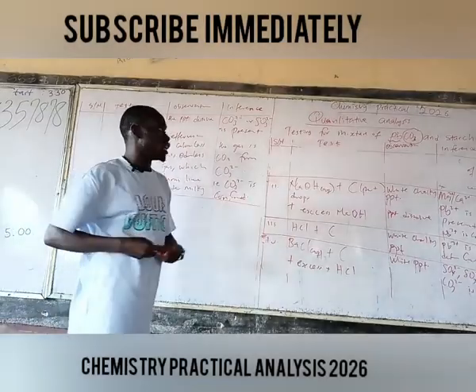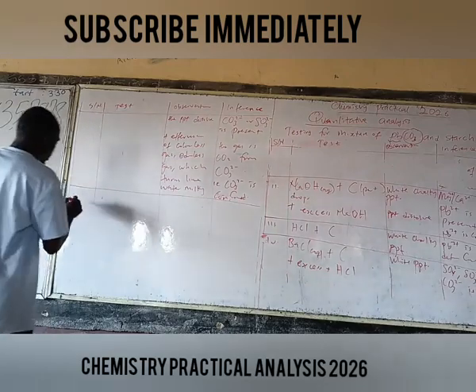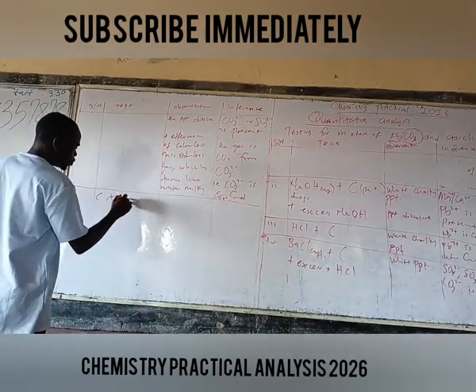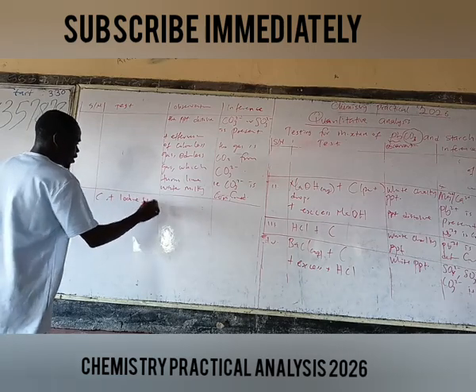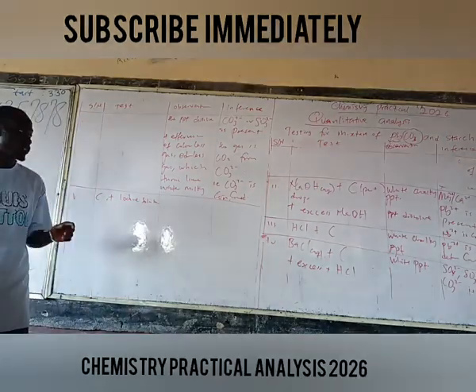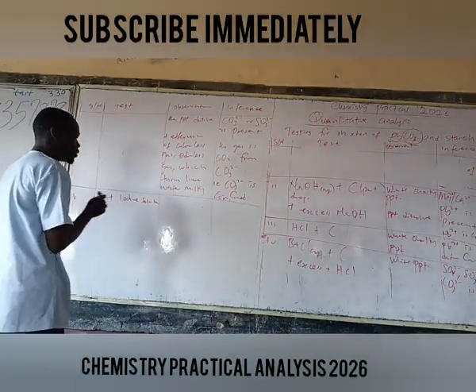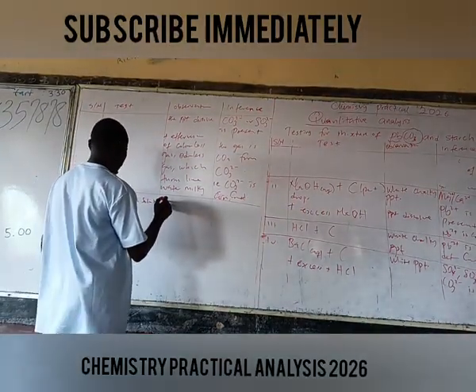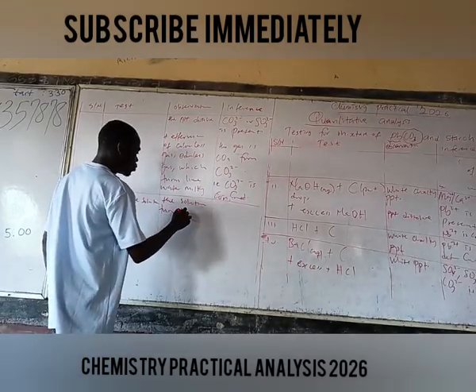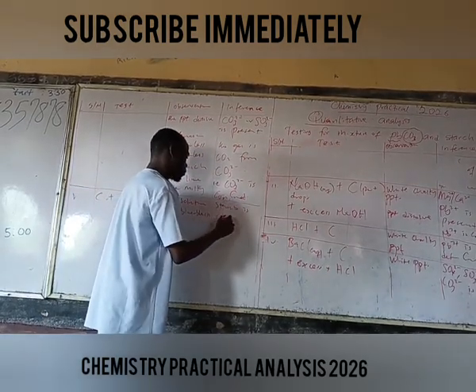Now then the last part. We have tested for the lead carbonate. The last part is to test for starch. And how do we test for starch? We add iodine solution. And you must be familiar with this if you are a student preparing for an exam, SS1, SS3 student. You must know the reaction of iodine with starch. When starch reacts with iodine, it turns blue-black. The iodine solution turns blue-black. Then we say starch is confirmed.